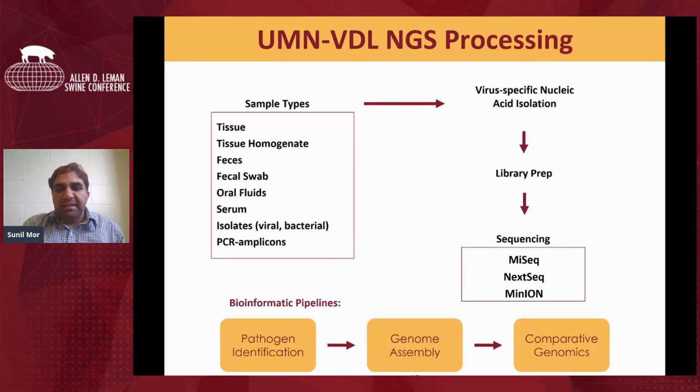Once we have the data, we identify the sequences to find out if it's a new, novel pathogen, or a vaccine-like virus or bacteria, or whatever other information the pathologist or veterinarian wanted to know from sequencing the clinical samples.